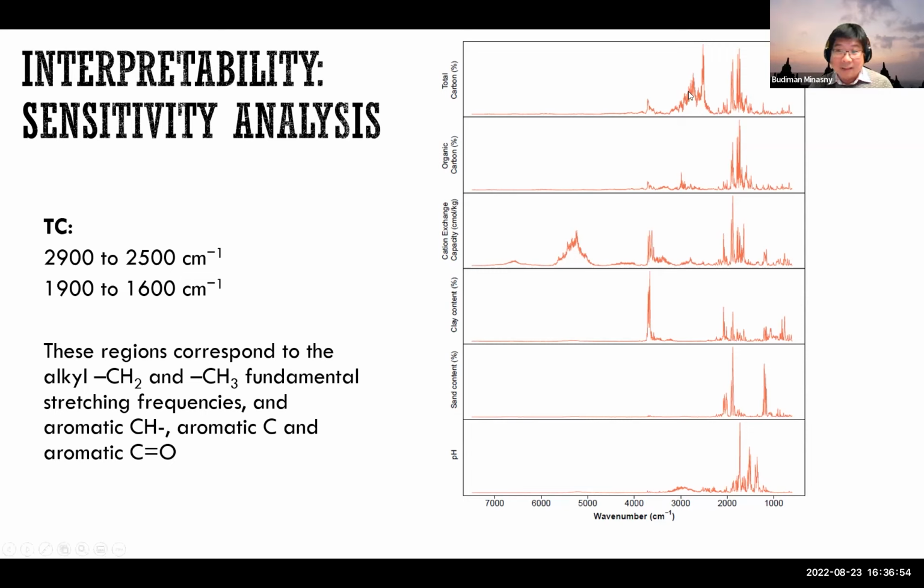But it's very sensitive in, for example, this particular peak, which we found corresponds to the fundamental stretching of the aromatic and alkyl functional groups of organic matter.